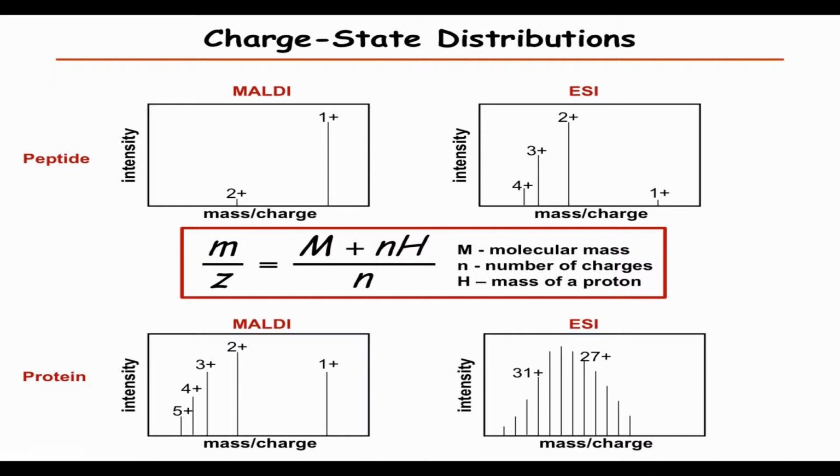You said you divide by the charge, or you divide by the number of charges? Number of charges. Yeah, sorry. Yes, number of charges. So n is the number of charges.